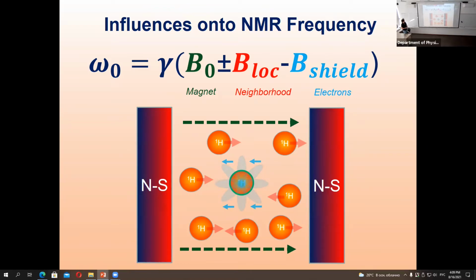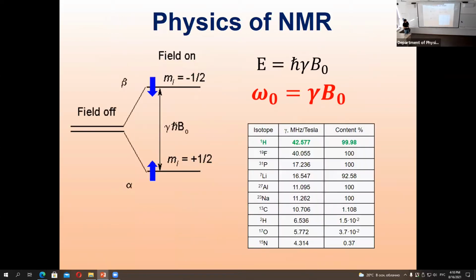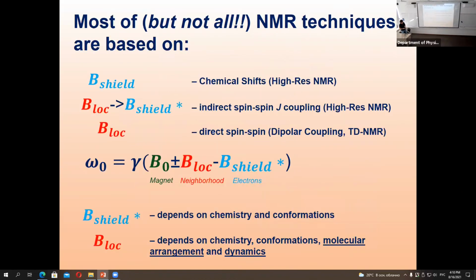So this is the local field that they produce. Also, each nucleus has its own structure of electrons, and these electrons are being influenced by the main magnetic field that is produced by the magnet. These electrons start to shield this field, and they lower the field on the nucleus. So the frequency of the resonance, if it was 42.577, if we have some nuclei with electrons, just any kind of water or ethanol or anything, these electrons slightly, by some ppm, shift the frequency.